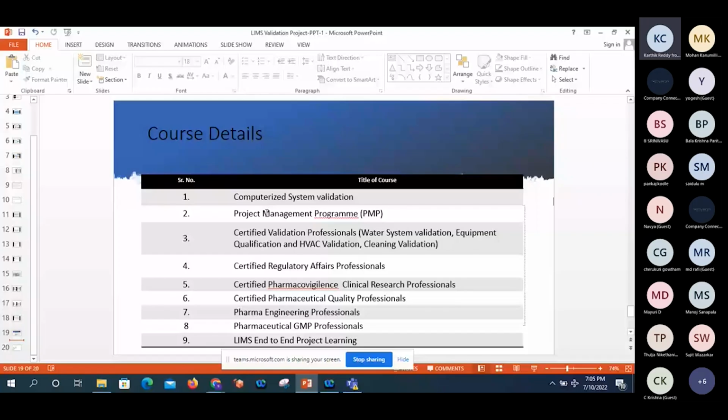Karthik sir, I have one doubt. Actually, in LIMS software, for example, today I have a night shift. Before 12, I opened the LIMS. After 12, I continued and gave the standard entry. But the date does not change, sir.